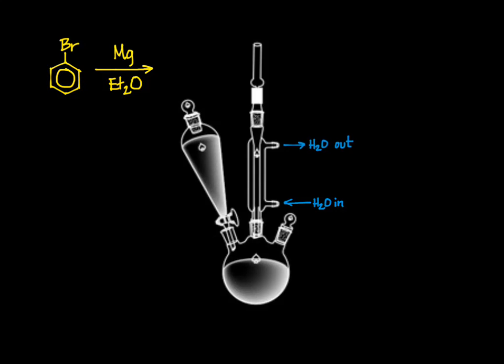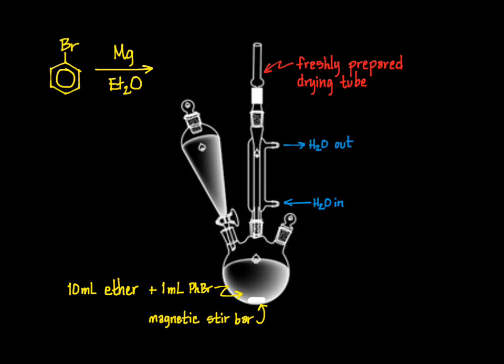The formation of the Grignard reagent is sufficiently exothermic that the ether will boil, so the reflux condenser needs to be hooked up to cooling water in the usual fashion. As I described earlier, the drying tube needs to be freshly prepared. A magnetic stir bar is then added to the flask, and it's positioned over a stirrer. Now the reagents are introduced. Because the Grignard formation is so highly exothermic, mixing all of the bromobenzene with all of the magnesium could result in a runaway reaction. We can prevent this by introducing only a portion of the bromobenzene to start with, and then adding the remainder slowly later on. So you'll begin by adding 10 milliliters of anhydrous ether and about a milliliter of the bromobenzene to the flask. The remaining bromobenzene you'll dissolve in 10 more milliliters of anhydrous ether and place in the addition funnel.